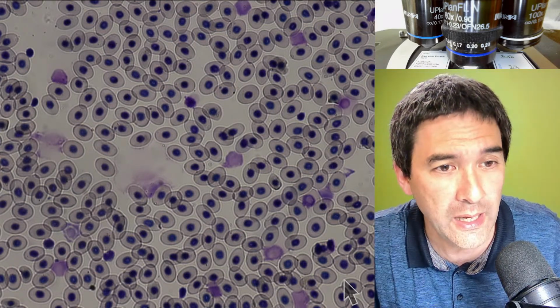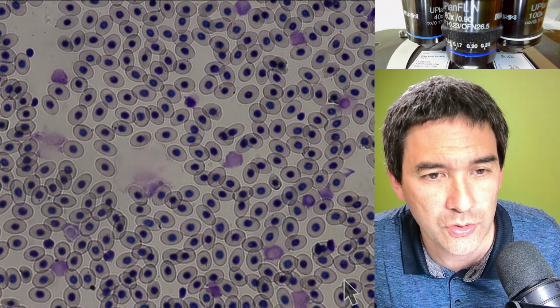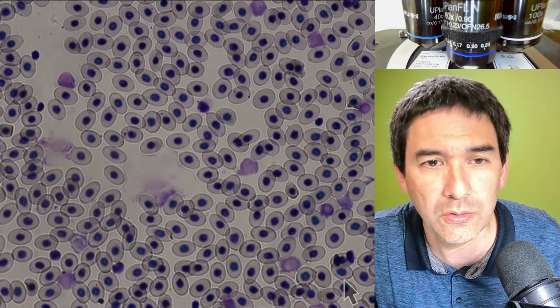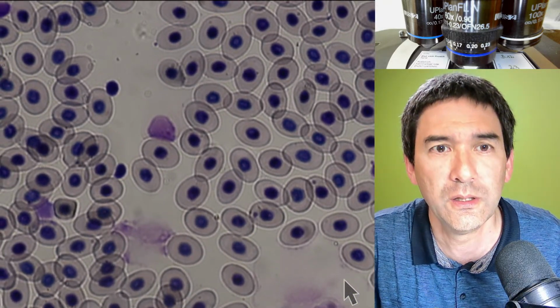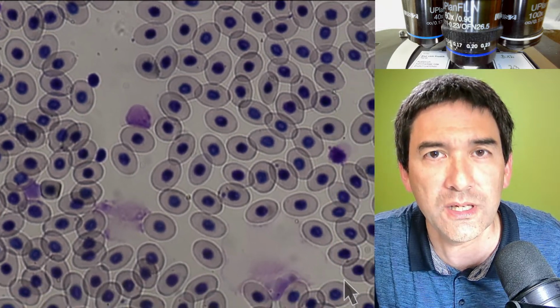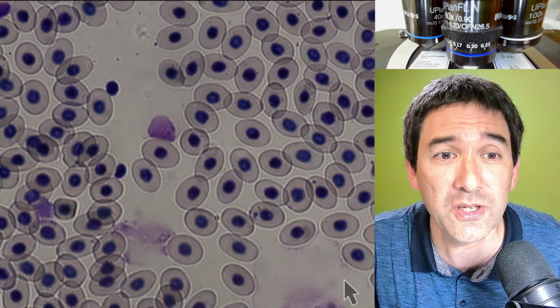You can, but you're not going to gain anything. I'm just going to show you over here. Here it is, right? What I could do is just go up with the magnification and stretch it more and more. Of course, it's going to be bigger, but you're not going to see more, because we've already reached the limit of resolution. It's going to be bigger, but more blurry.